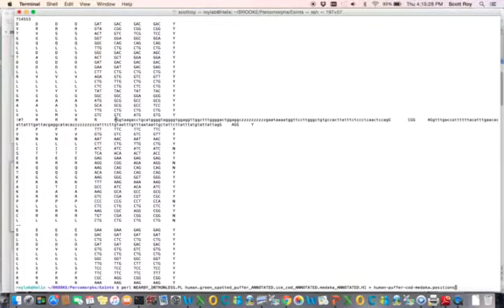And there are a few ways we could do that. What I think we'll do is go ahead and get the local protein coding sequence from human. And so that protein sequence is DVTGGLGTDELRLLYGMAL, and so forth.